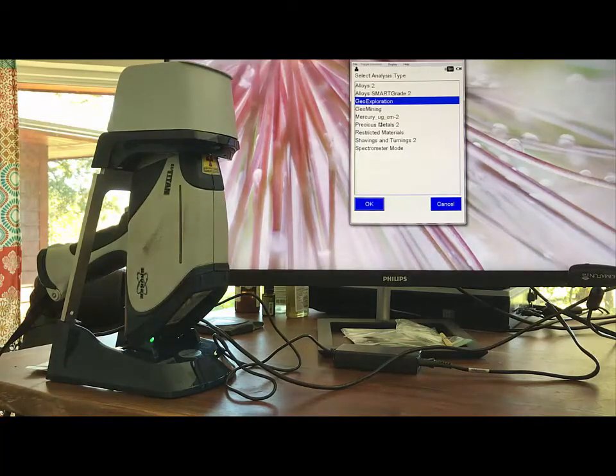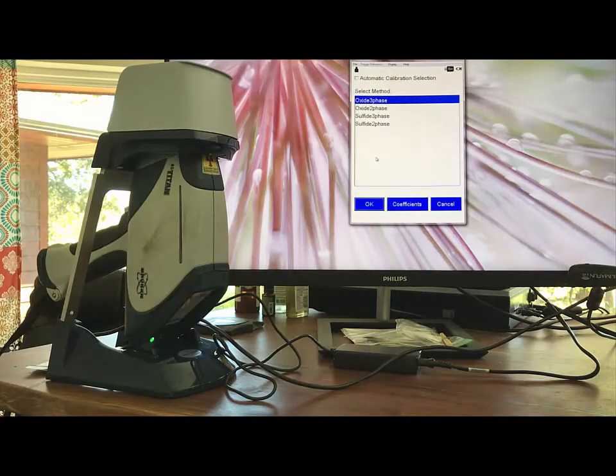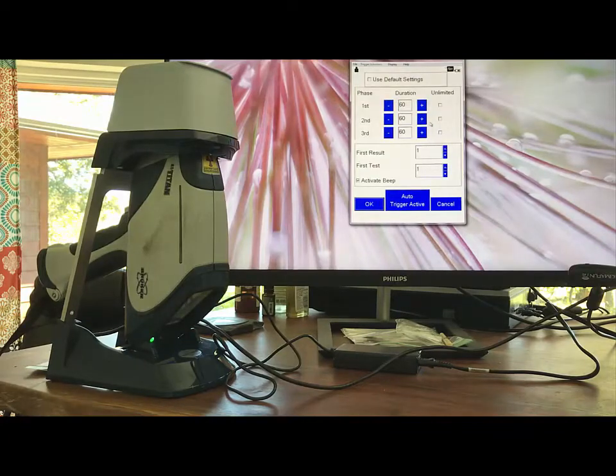Once you have everything set up and have chosen the correct calibration library and method, you set the phase lengths — we have recommended phase lengths for you. In this particular run, we'll be using phase 1 of 20 seconds, phase 2 of 20 seconds, and phase 3 of 20 seconds.